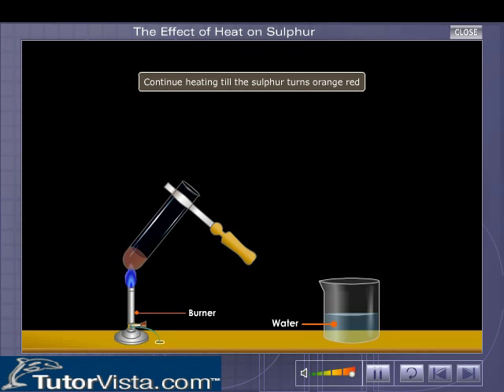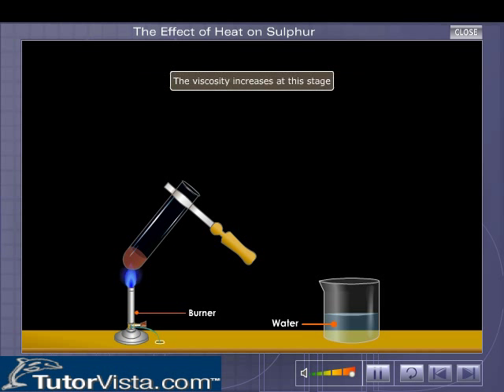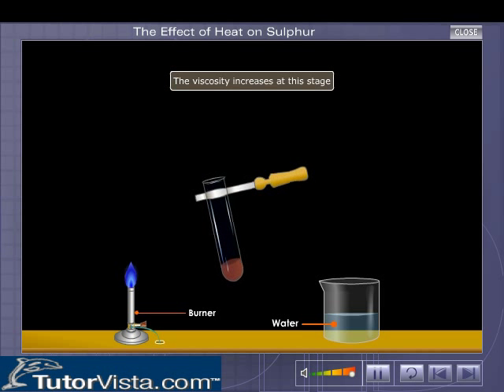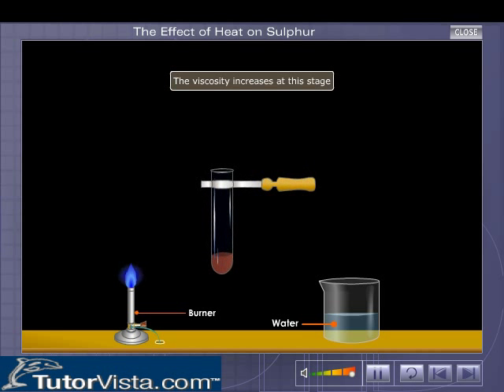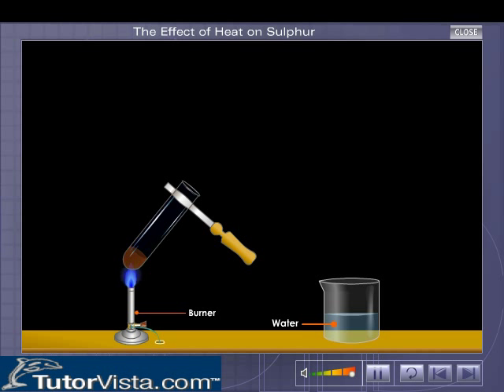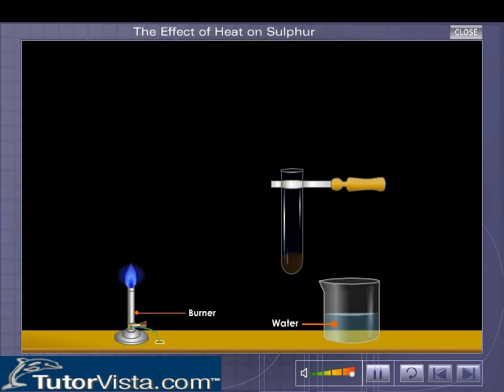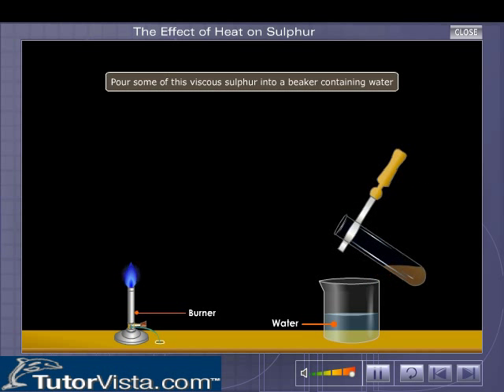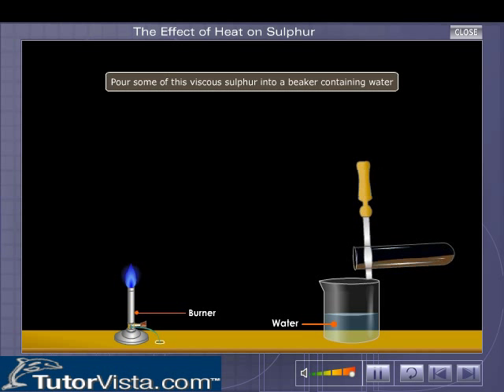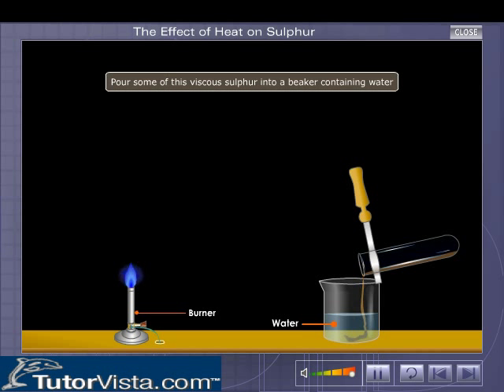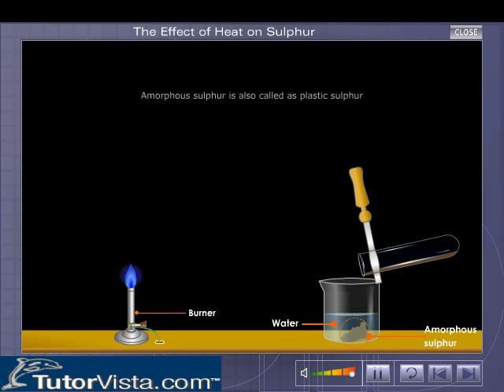Continue heating till the sulfur turns orange-red; the viscosity increases at this stage. Pour some of this viscous sulfur into a beaker containing water. This forms an amorphous allotrope of sulfur, often called plastic sulfur. It looks like a well-chewed bubble gum.